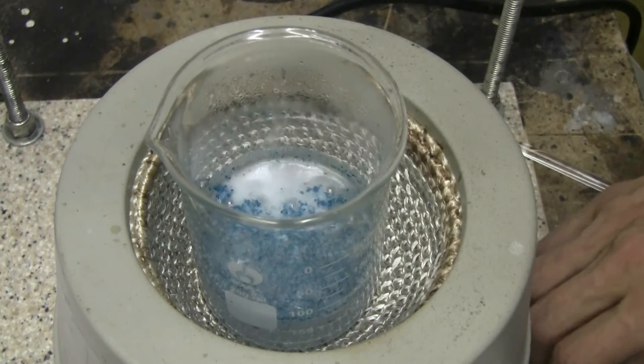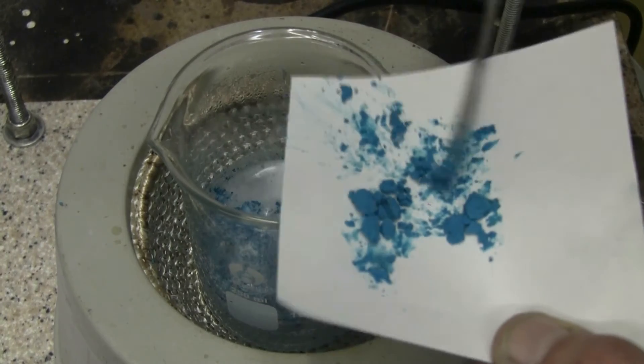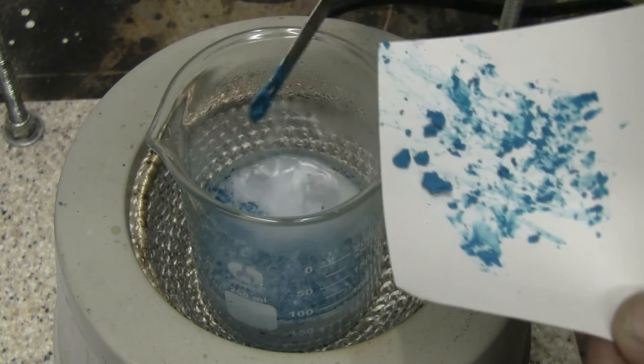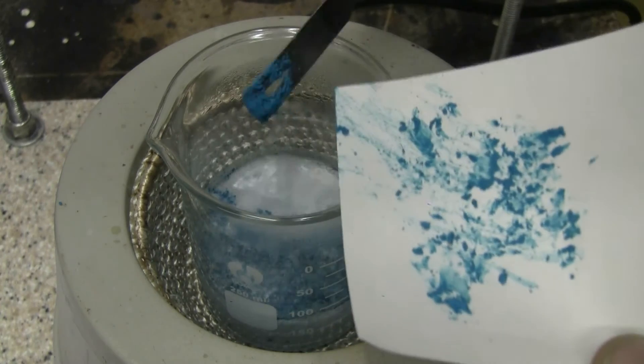The mixture's warmed up and now I can add copper carbonate. As I add the copper carbonate, there's a fizzing as the reaction occurs.